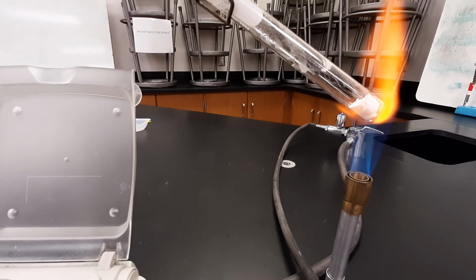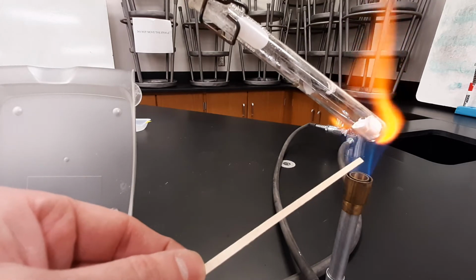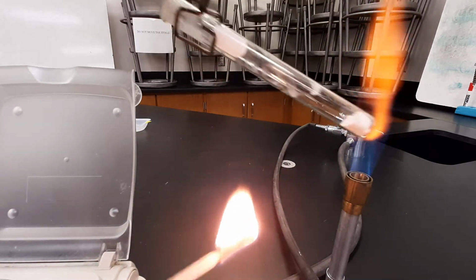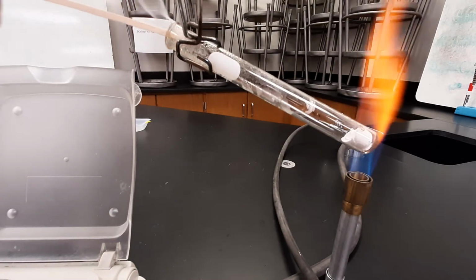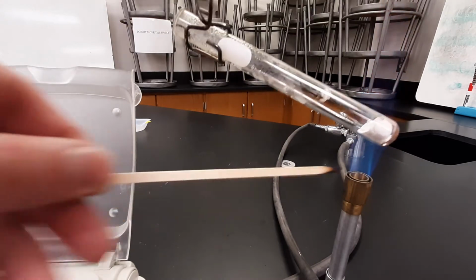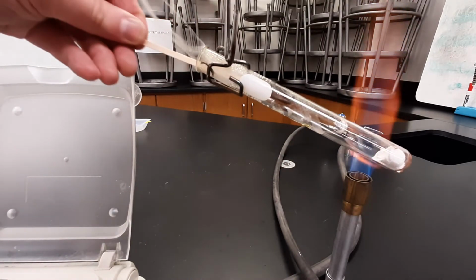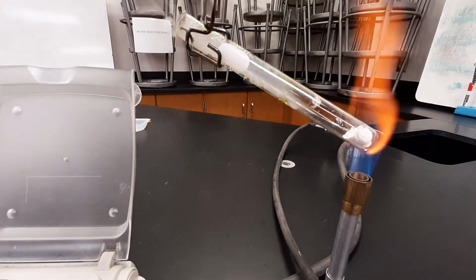Okay, it's now been about 1 minute and 30 seconds since I started heating this strongly, so I'm going to light a wooden splint on fire. I'm going to place the wooden splint inside my test tube. The wooden splint went out. I'm going to retest it. A lit wooden splint going into the test tube. It immediately goes out in the presence of whatever gas is in there.